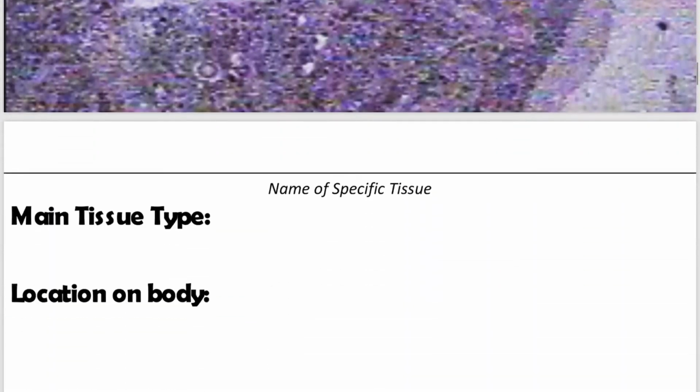So this is the one on your brace mat that doesn't really fit with saying simple or stratified in the cell shapes. Endocrine and exocrine glands look very unique. They look really, really gritty. Now, this is the glandular tissue. And glandular tissue just has this appearance, this really rough textured appearance. And that's what makes this one, I think, really, really easy to identify. So specifically, this is an endocrine gland.